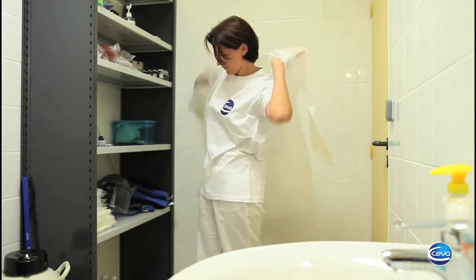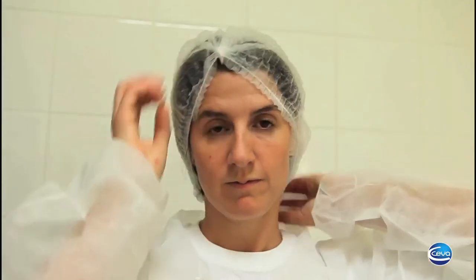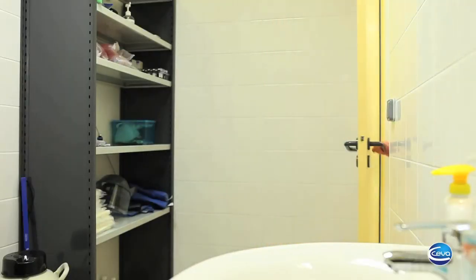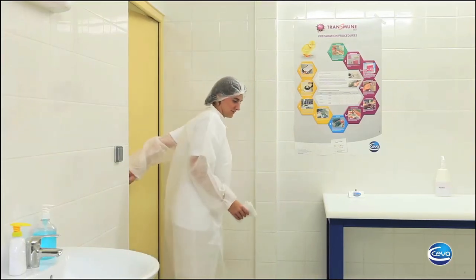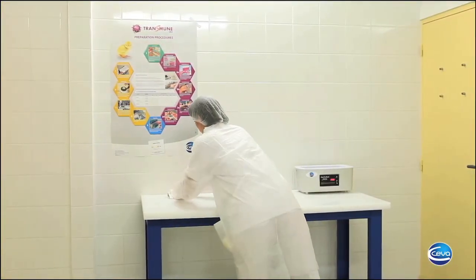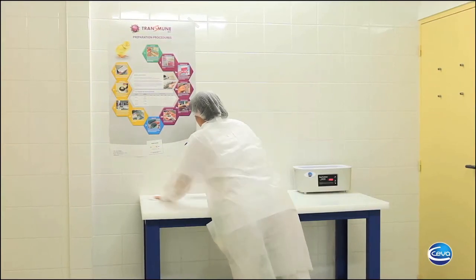The vaccine preparation room should be as clean as possible and on a strict cleaning regime. We recommend to wear protective clothing and a hairnet. You will also be wearing disposable gloves when handling vaccine material. It is important to have the workbench free from dust. Clean it with an alcohol solution and dry with paper towel. Do the same for all material that may be used, like the vial holders.